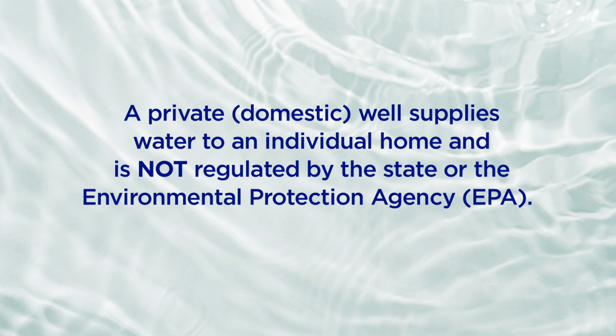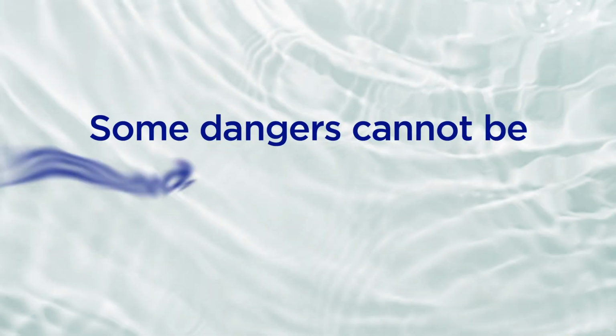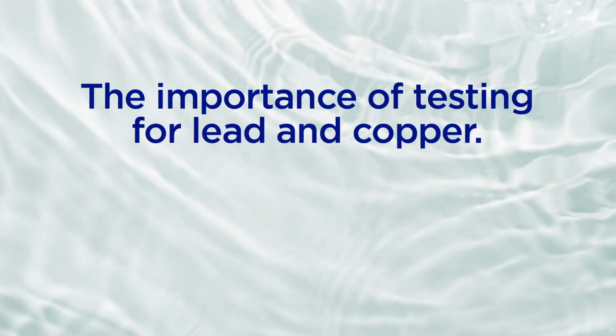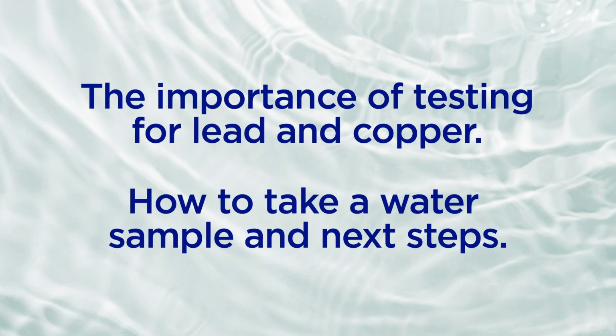First, you should know that private well owners are responsible for the safety of their water. Regular testing and maintenance of your well is the only way to tell if your water is safe, as harmful contaminants cannot always be tasted, seen, or smelled. In this video, we will cover the importance of testing your well water for lead and copper, how to take a water sample, and the next steps once you know your test results.